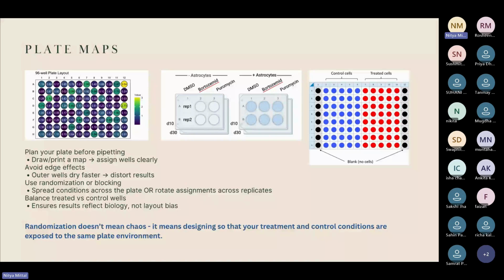You have to make sure of one other part, that you're focusing on replicates. So say you have cells from patient A, B, C, you need to make sure that you have a minimum of 3 replicates. So minimum 3 wells per patient. You will always have more than that if you're working with 96 well plates. But say you are working with a 6 well plate, like the second case, you need to make sure that you have at least 3 replicates.